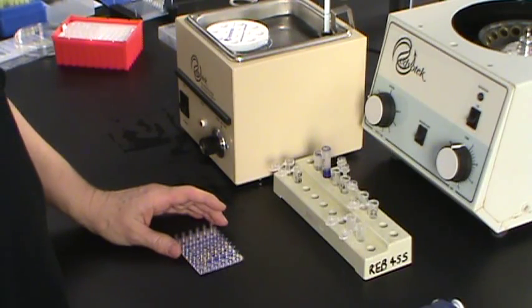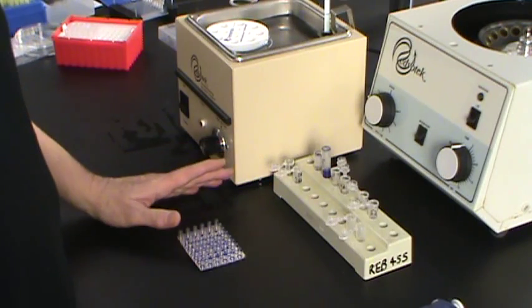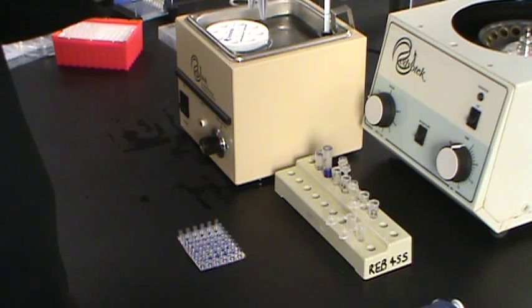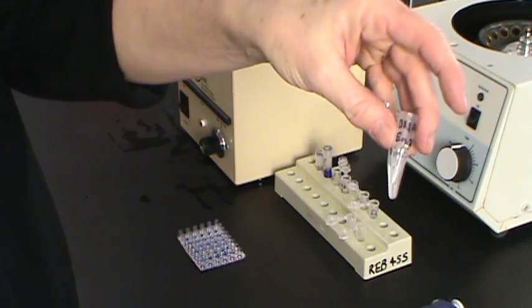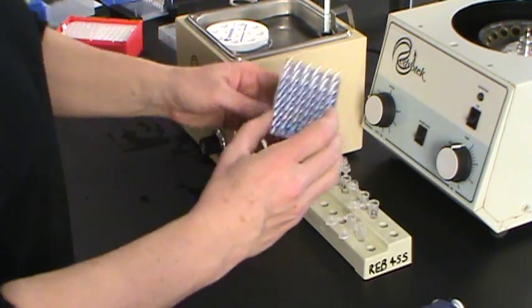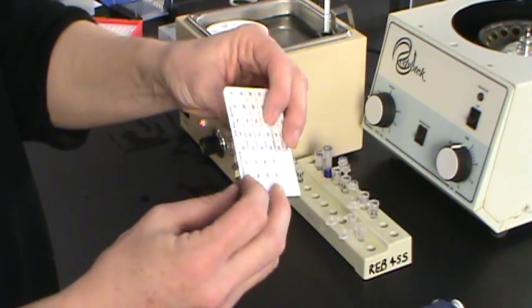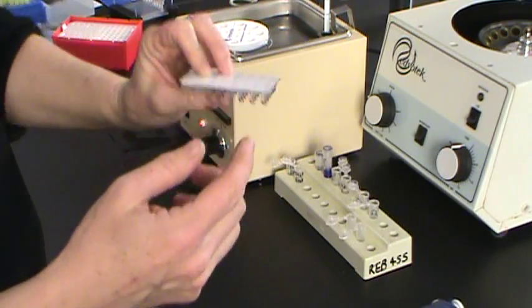The way you get your reagents this week might be a little bit different too. You'll have a lot of things in small tubes. There are some DNA samples that are said to be the crime scene DNA, and those will be available to you either in a small tube like this, or they may be given to you in a card like this, and those are quite nice because the card just has the sample that you need and you'll pipette from there.